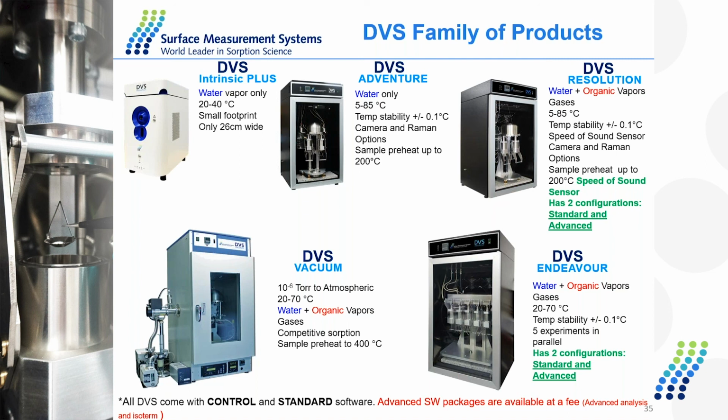I believe you are organizing a symposium, right? Yes, the symposium. I think there will be some applications on surface analysis and DVS on food sciences, but I'm not sure about additive manufacturing. About food powders, yes, for sure. For additive manufacturing, that's a very good question. We don't have data yet, I think, but Majid can answer that for us. In terms of food powders, we do have some presentations. I can also add that we have done work for our customers on flavors and especially food materials, with both DVS and IGC.